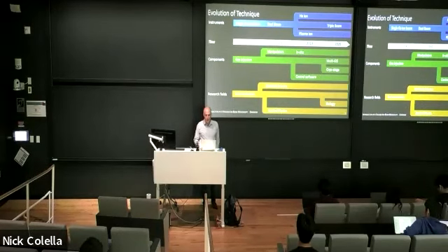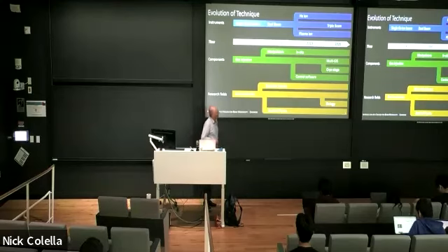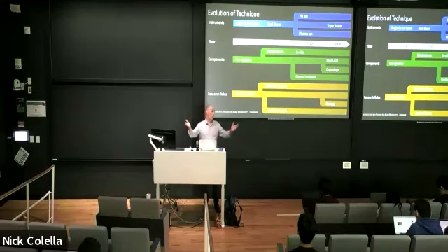And right now, the latest developments that are happening is that, as you can see, we're adding cryo stages to further expand the range of materials. And as you can see at the bottom, the range of applications is broadening and broadening from starting out with semiconductors, then we got into material science, physics, and now we're also working with biologists.